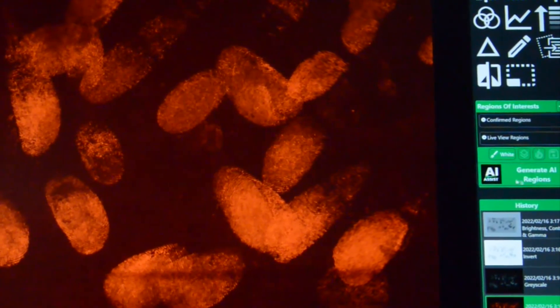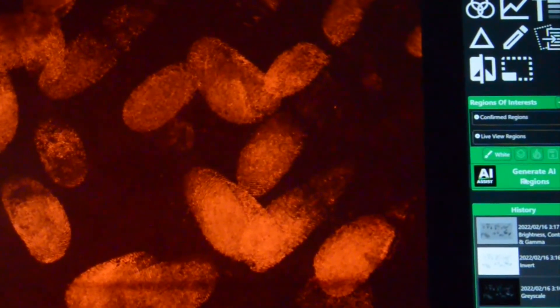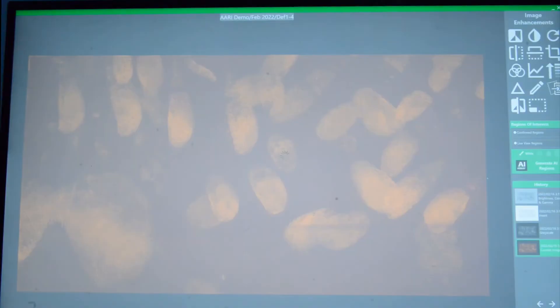And what we can do here is using our image, we can simply press generate AI regions and the system is now going to scan for ridge detail for us and it will mark up areas of interest.